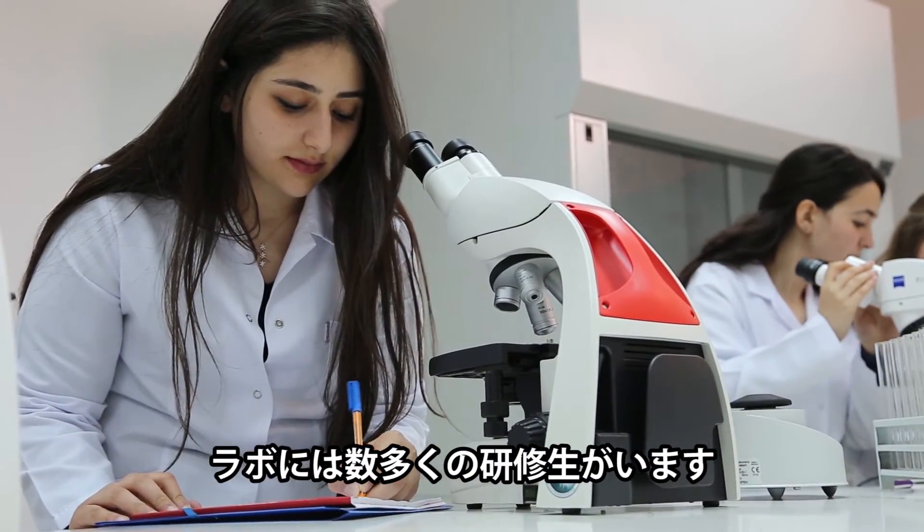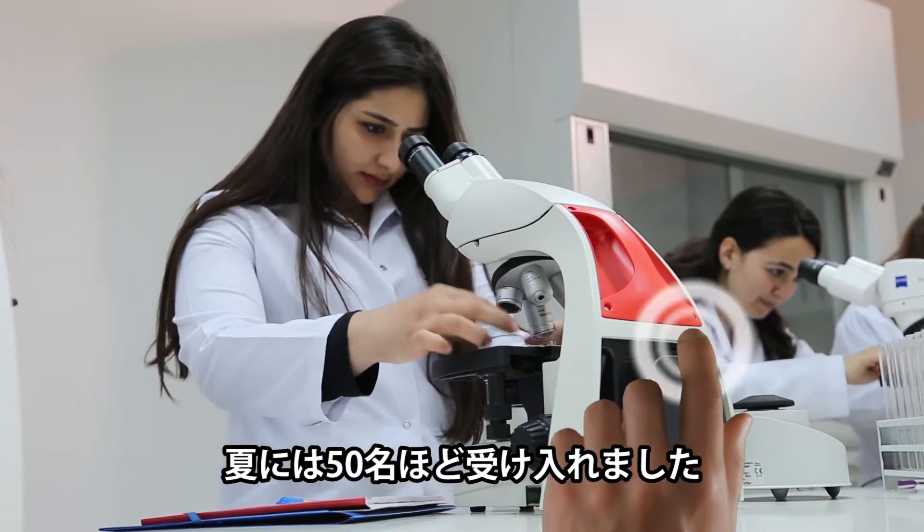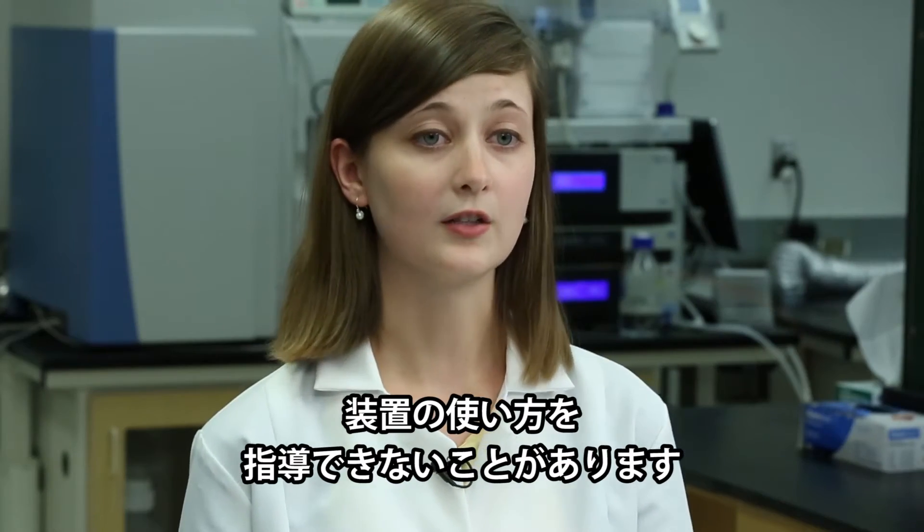Our lab has a lot of interns. We like to involve a lot of students throughout the year. Our lab gets up to 50 people during the summer, and sometimes their investigators are too busy to inform them on how to use instruments.